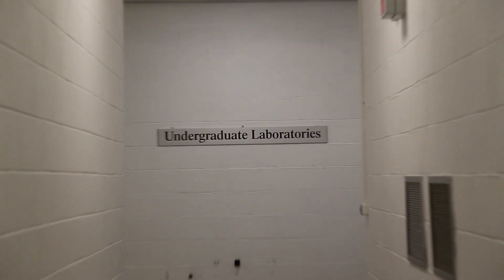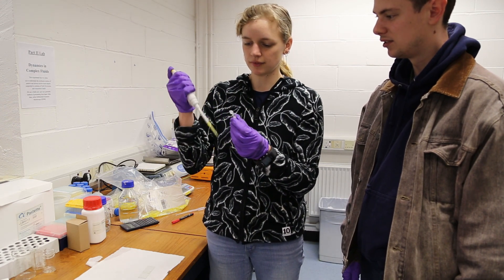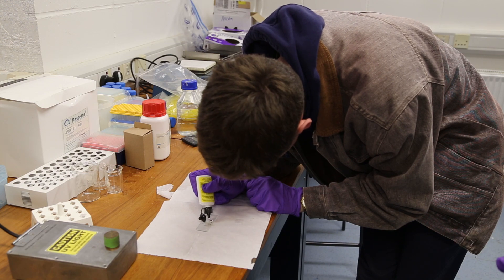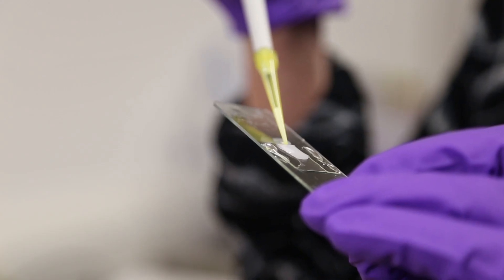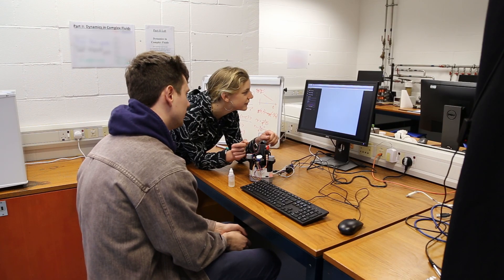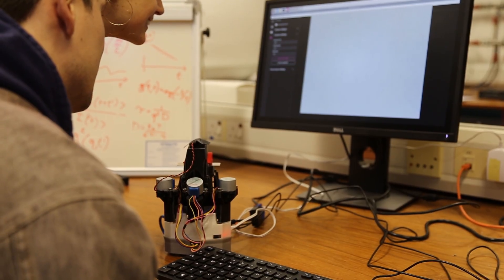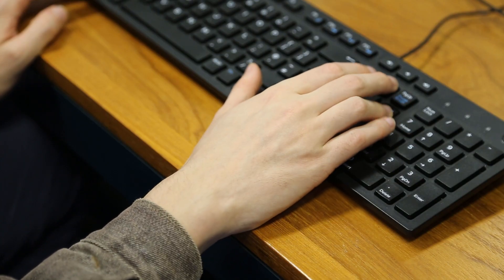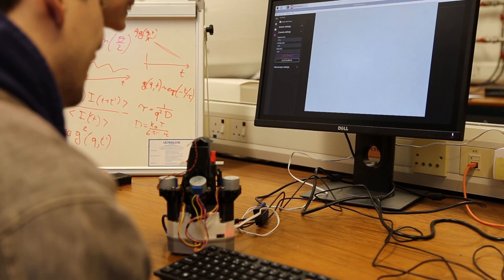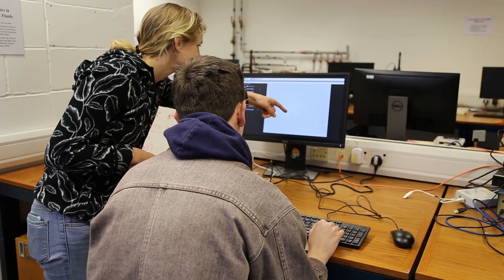Another use of the OpenFlexure microscope is for education. From schools to universities, microscopes provide a great opportunity for students to observe things that they have never seen before. The OpenFlexure microscope opens up these opportunities to even more students. As well as a practical tool for physics and biology study, the modularity and open source code base of the OpenFlexure microscope means students and teachers can adapt and improve the microscope.